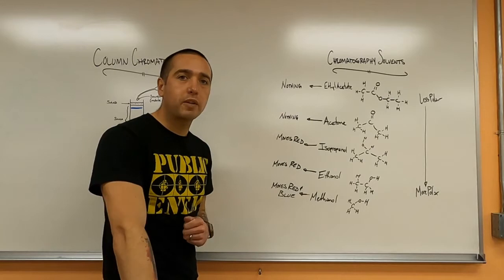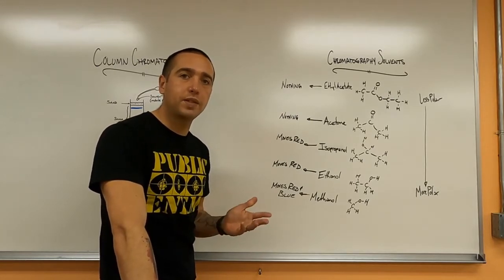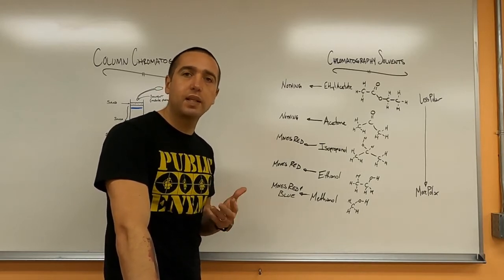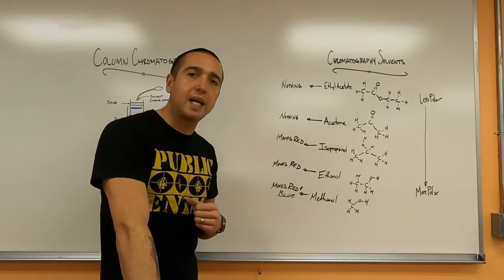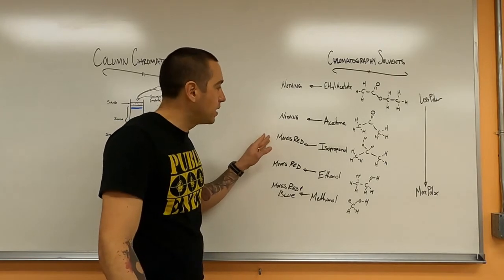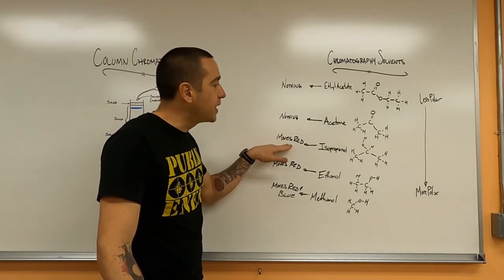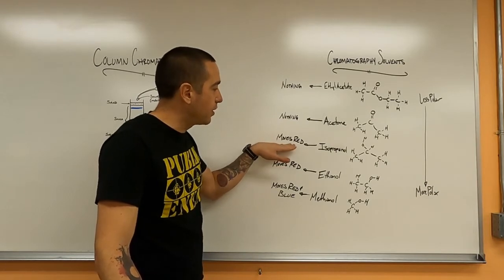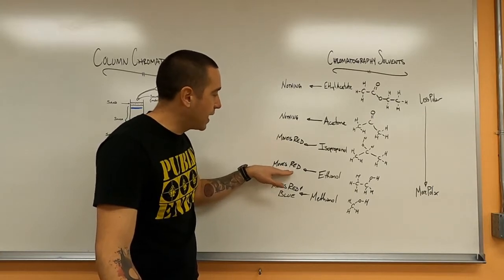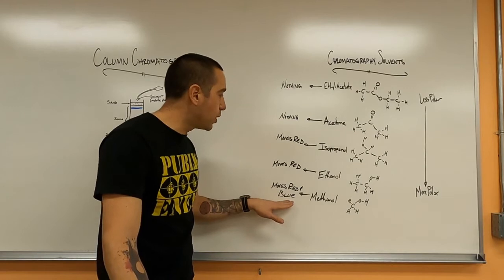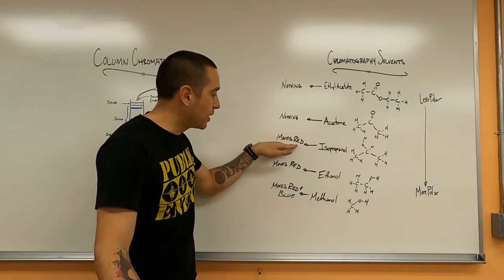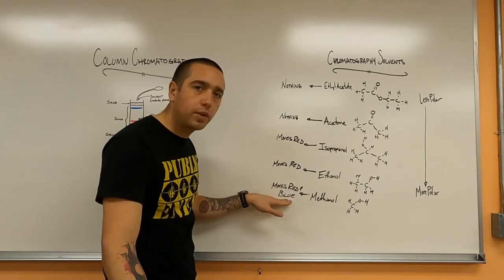The paper chromatography we did was about deciding which solvents to use. From my results, ethyl acetate did nothing and carried neither dye. The acetone also carried nothing. The isopropanol moved the red dye, which should carry the red through my column leaving the blue at the top. The ethanol moved the red and a little bit of the blue. The methanol moved both, so I can use isopropanol to get the red out, then use methanol to get the blue out.